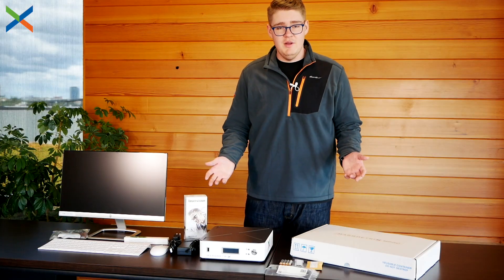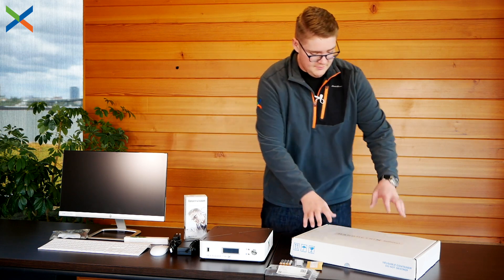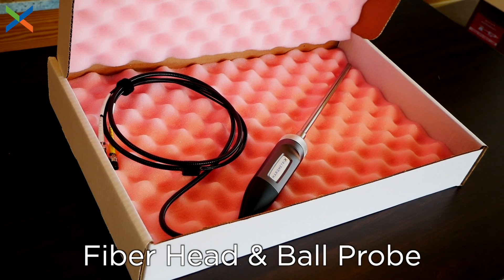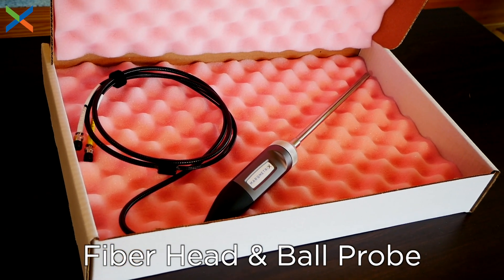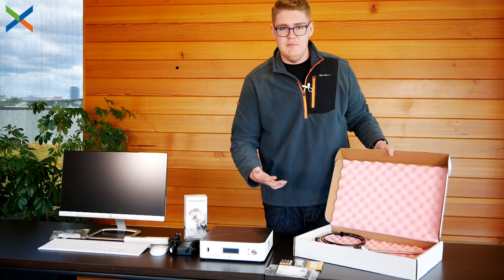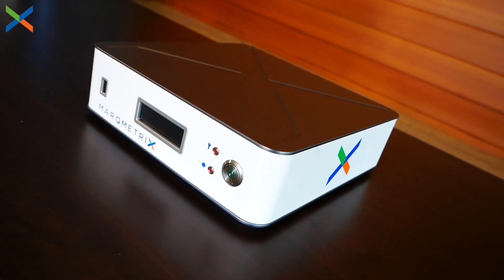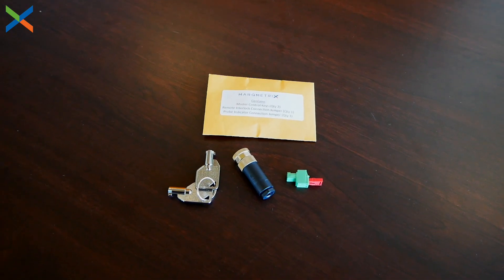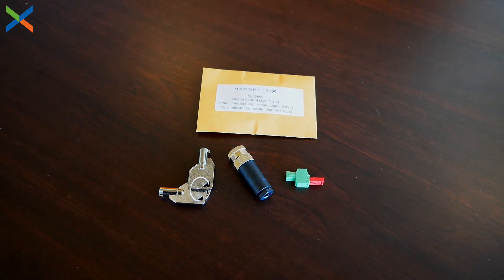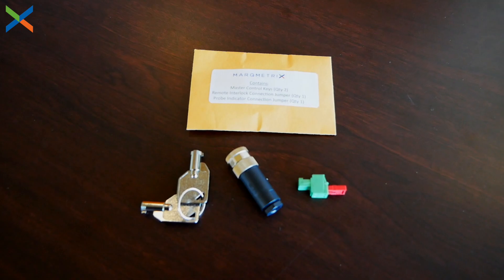Once you unbox the complete all-in-one system, this is everything that you should have. You'll have the ball probe — make sure you inspect it for any kinks or bends in the cable, as this is extremely sensitive fiber optic cable, and if anything is damaged you might have an issue taking a good sample. You'll also have the all-in-one box itself, and a little bag for the keys, which includes the master control keys, the remote interlock connection jumper, and the probe indicator connection jumper.